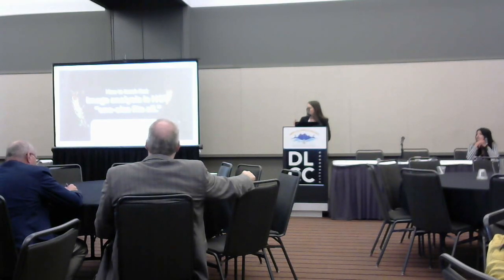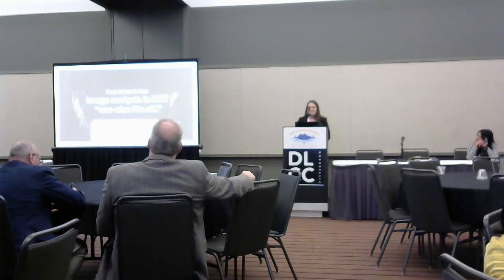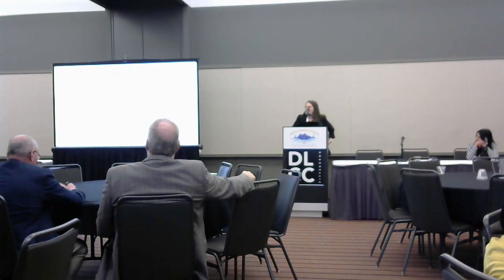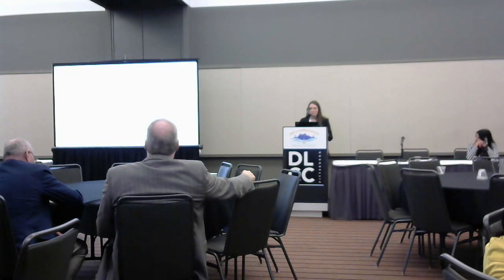And so I've titled my talk today, How to Teach That Image Analysis is Not One Size Fits All, because I feel like that's a really common assumption that people come into when they start new projects. So main takeaways for my talk today, I hope that you are able to take away what researchers need to understand to be successful image analysts. Some benefits and drawbacks of two different learning approaches that I have recently implemented over the past year to try to teach these strategies to researchers.